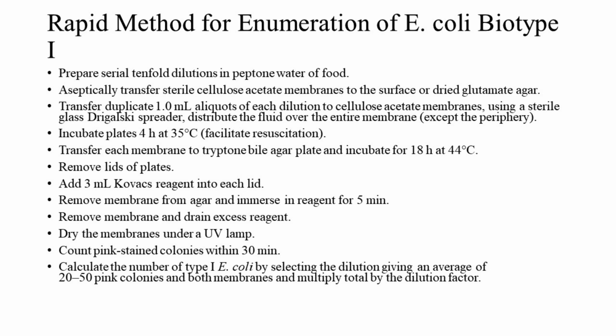Remove membrane and drain excess reagent. Dry the membranes under a UV lamp. Count pink-stained colonies within 30 minutes.